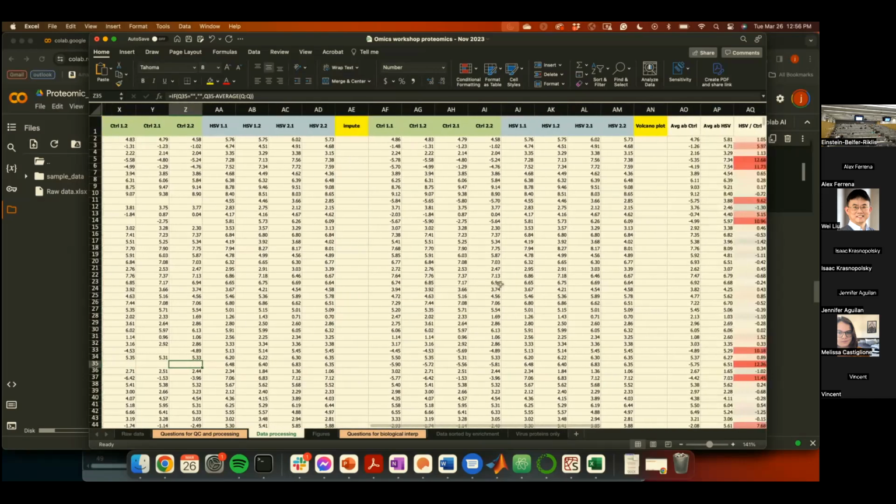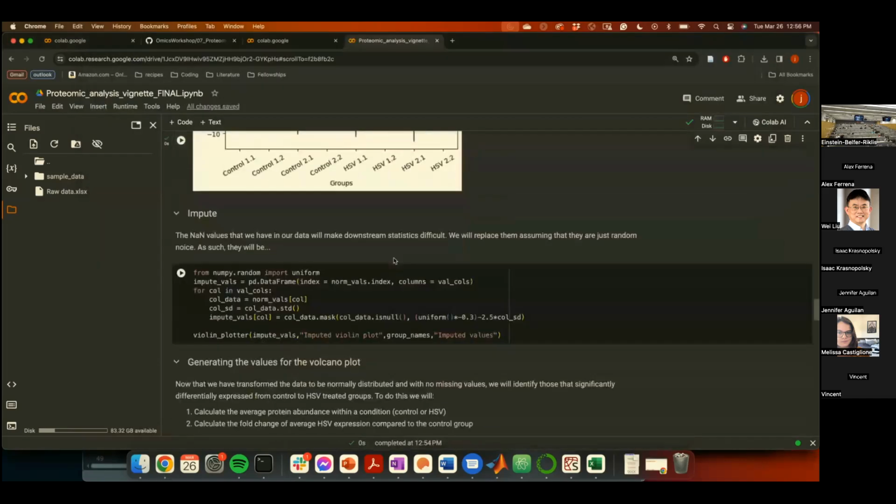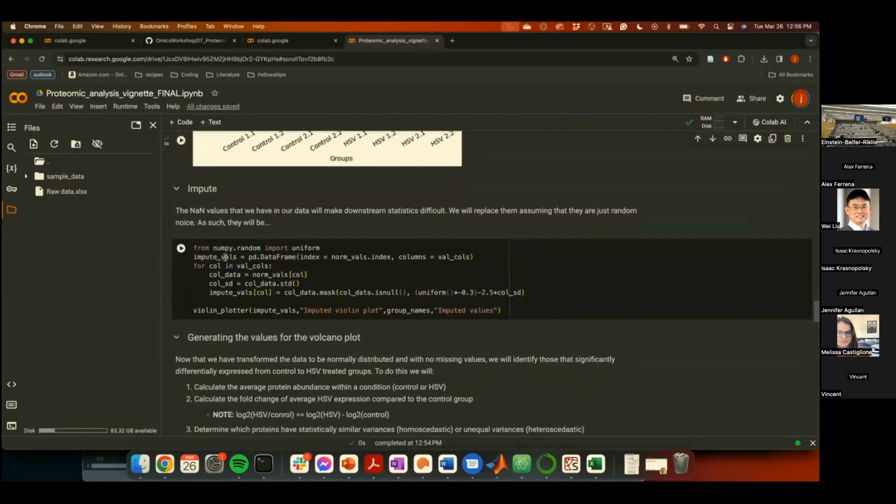And how that looks in math is, so in the code, again, something that you always do when you code in either Python or R is that you initiate your variable that's going to store your results. So we initiated that. And again, same indices as the previous one, same columns as the previous one. And for each column, we're going to calculate its standard deviation.